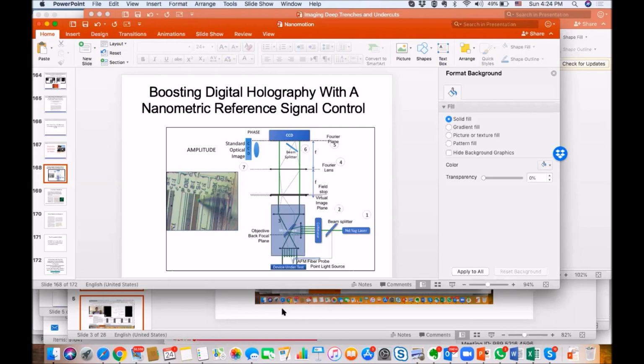To really aim for a general market of the use of these systems for these types of microscopies that I'm telling you about, you need not necessarily nanometric resolution.